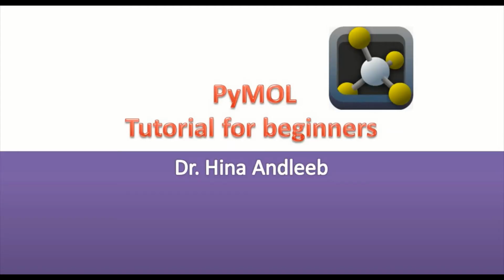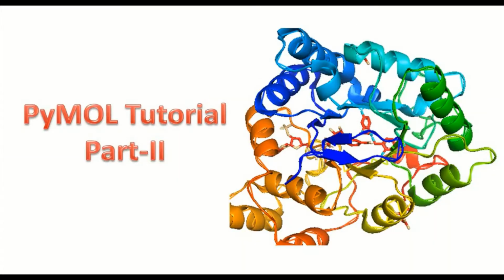Dear students, welcome to the online lecture on Pymol tutorial for beginners. In this tutorial, you are going to learn about Pymol, the general controls and commands of the Pymol. You will also be able to get yourself familiarized with the mouse controls. We are also going to discuss how to open and save a PDB file. It will be interesting to learn how the proteins and ligands can be represented in different variations. This is part 2 of the Pymol tutorial, so let's continue.